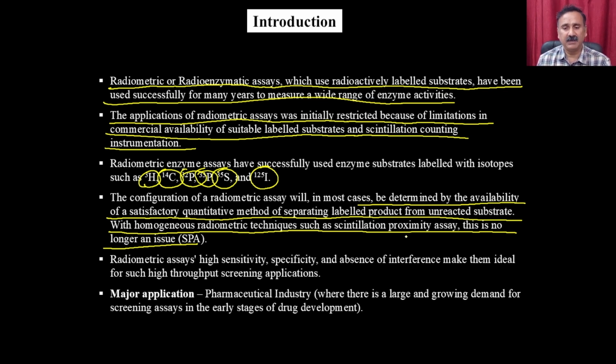But with the help of the scintillation proximity assay system, which we are going to discuss in this particular lecture, there is actually no need to purify.